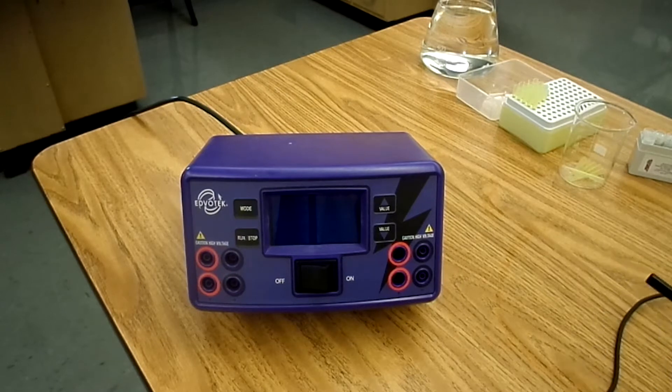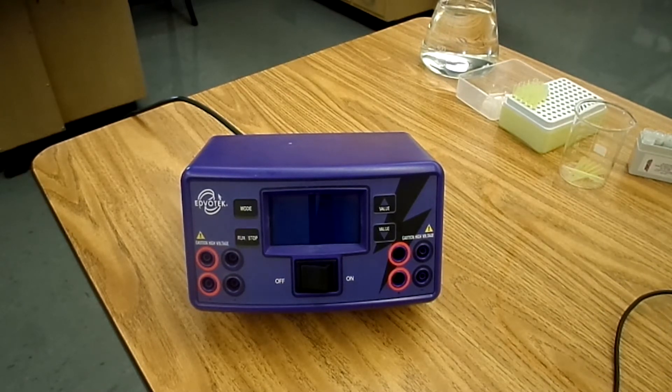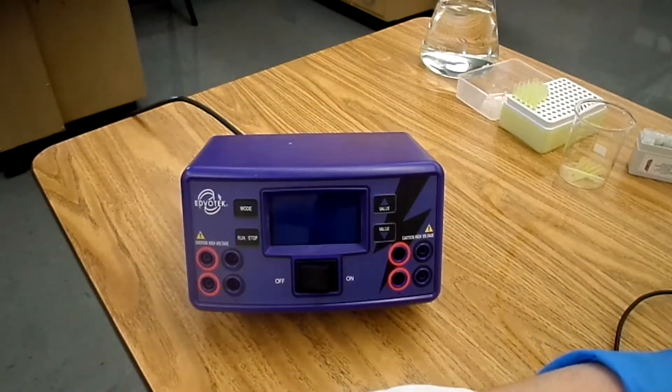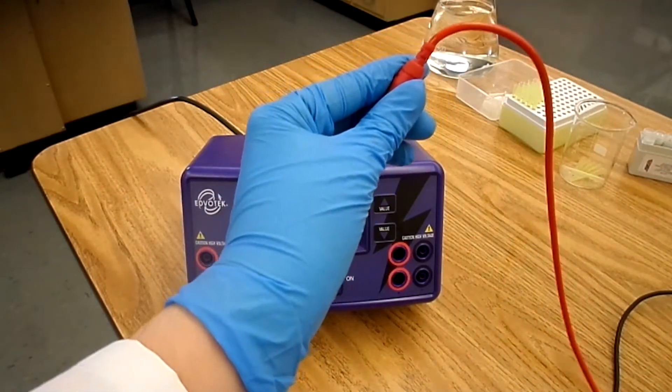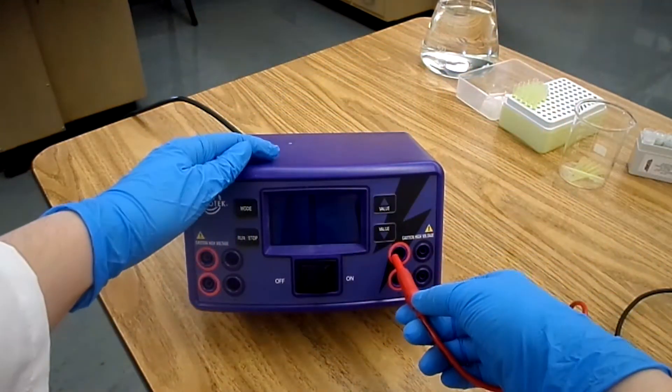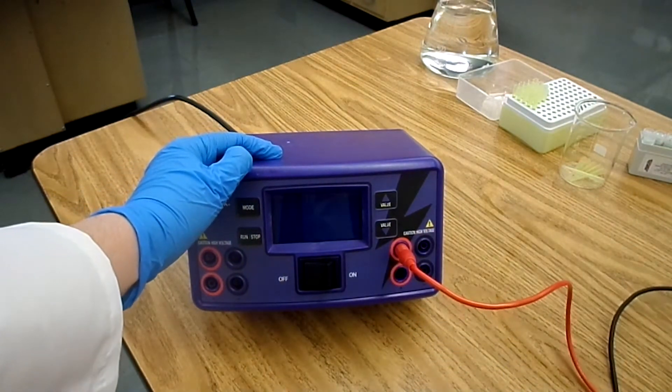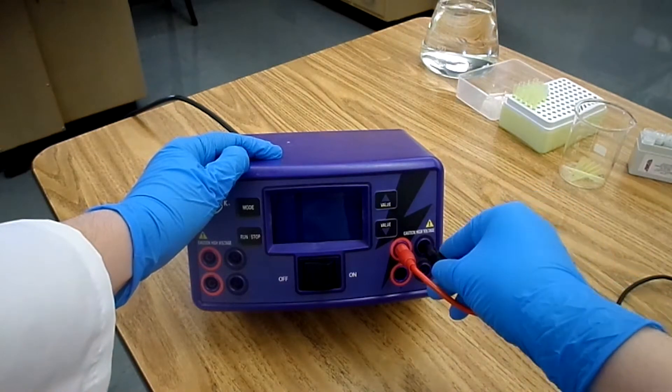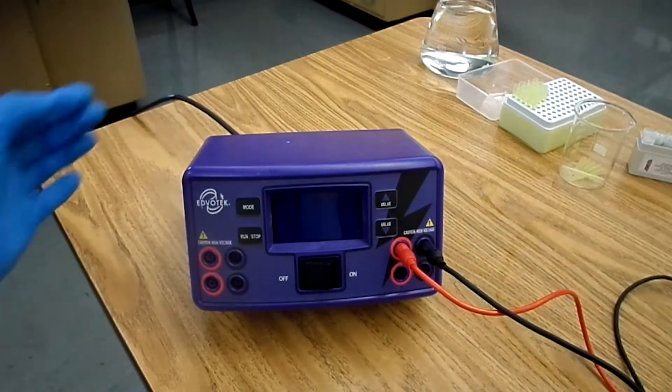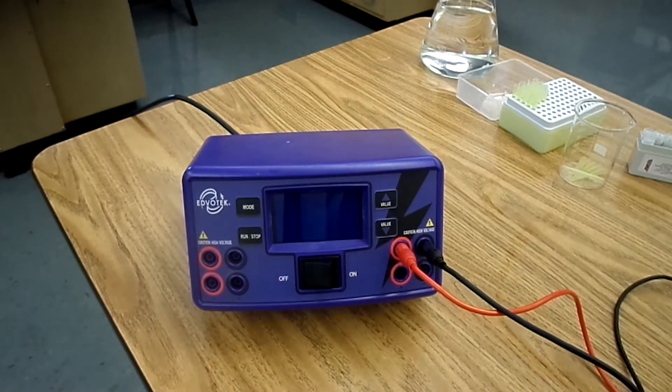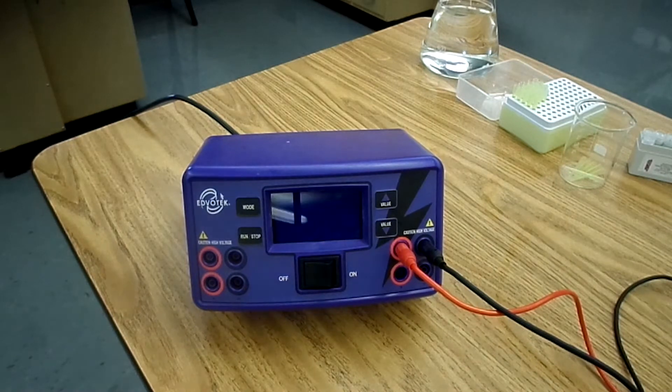Now we're going to plug the other ends of the top of the gel electrophoresis chamber into here. So we'll start with the red, and then do the black. And then we will plug in our power source.